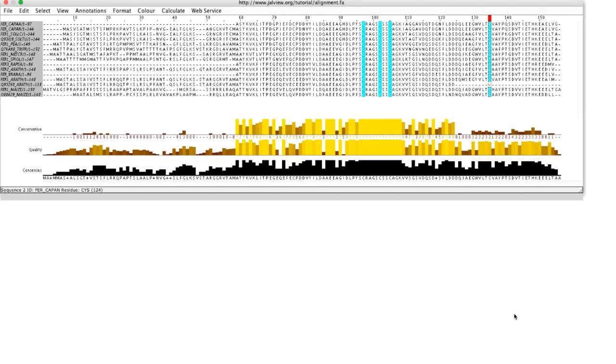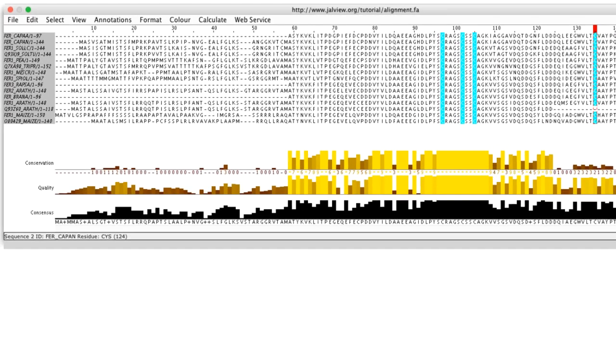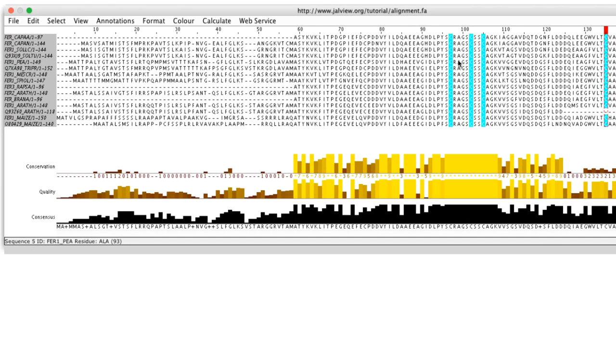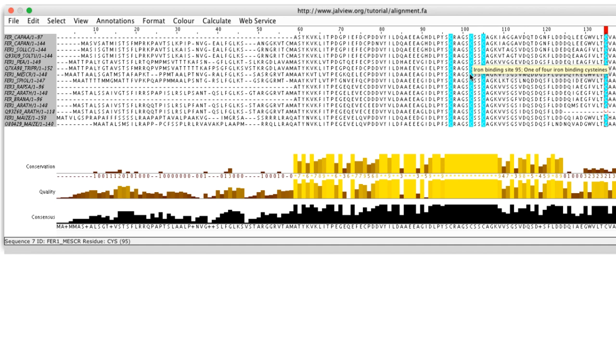These features will now be grouped. If I mouse over the feature, a tooltip appears describing the feature. Note, since the feature is located on the sequence, the position given in the tooltip is the residue number, not the column number.